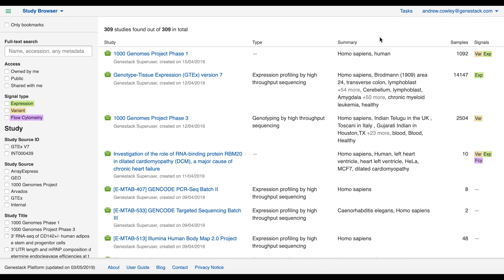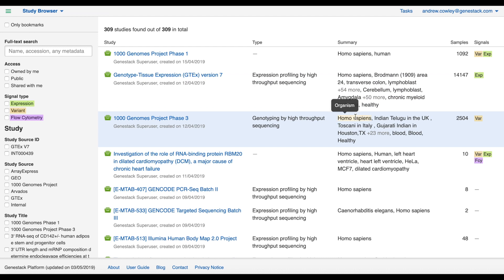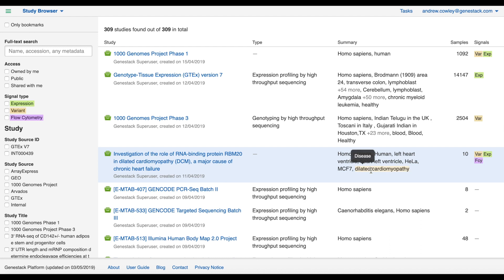You can hover over any name in the summary column and the name of the metadata field where the data comes from will appear. So here I can hover over Homo sapiens and it tells me it comes from the organism field. I can hover over dilated cardiomyopathy and it tells me that this information comes from the disease metadata field.